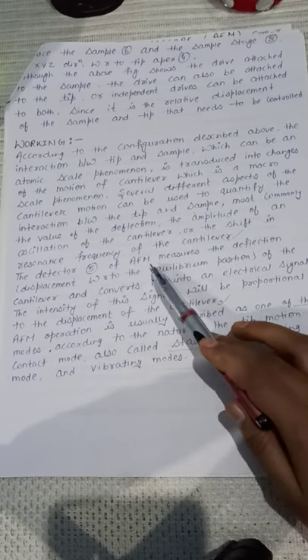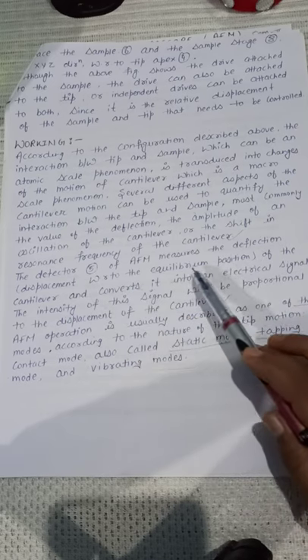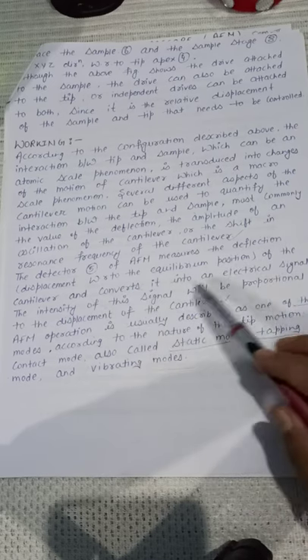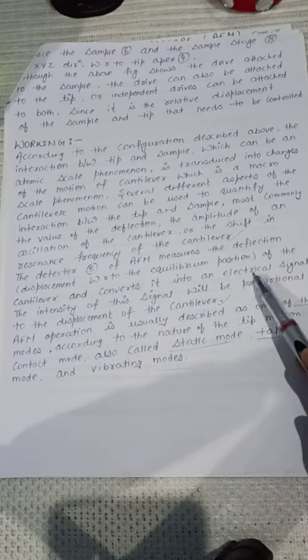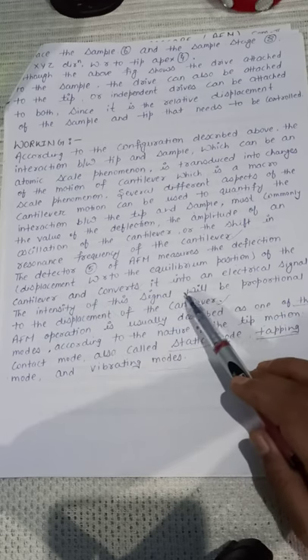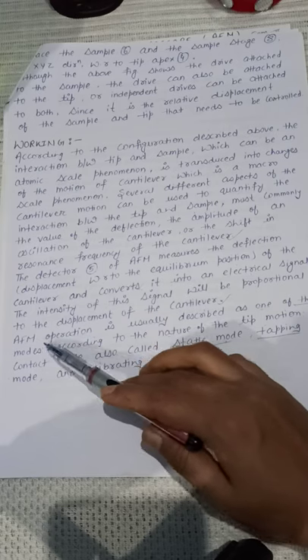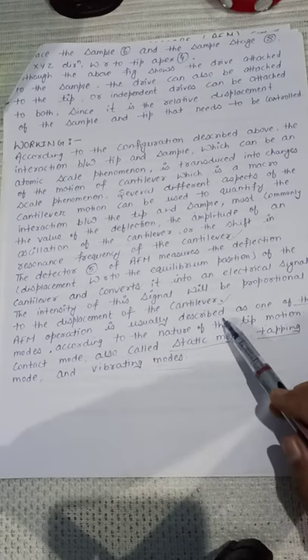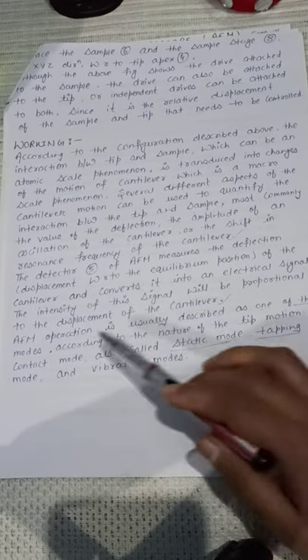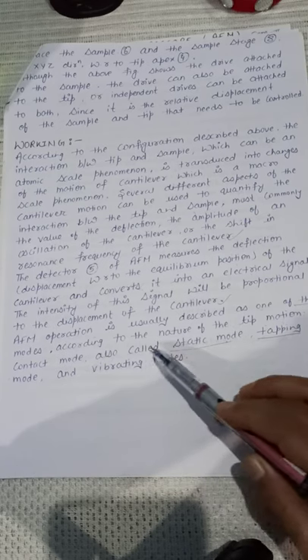The detector of AFM measures the deflection, i.e., displacement with respect to equilibrium position of the cantilever, and converts it into an electrical signal. The intensity of this signal will be proportional to the displacement of the cantilever. AFM operation is usually described as one of three modes according to the nature of tip motion: contact mode (also called static mode), tapping mode, and vibrating modes.